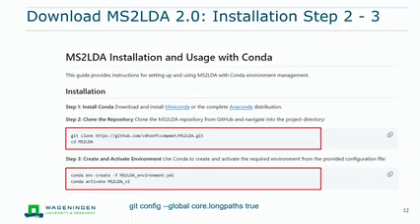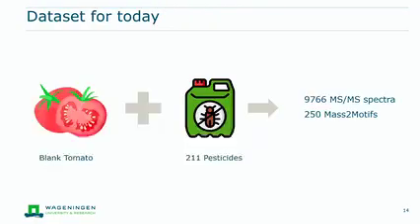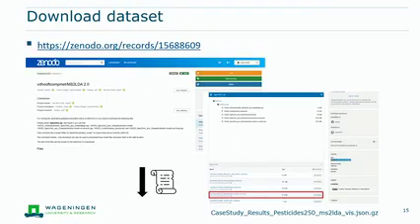All right. Okay, I think we tried it at least, so it happens. I think the bandwidth of the internet is not working for at least most of the people. So what we will do now is, let me skip a little bit ahead. We actually have to download something else, but that's maybe a little bit easier. And this is actually the data set we want to use today.